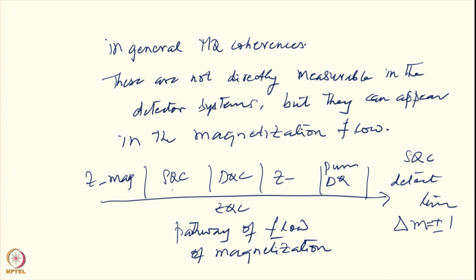I may want to have single quantums here, I may not want single quantums there, I want double quantums there, I can delete some of those, and manipulate them. This generates a whole lot of experimental schemes which are required for generating a specific type of information in your spectra, and that is the power of this multidimensional spectroscopy.